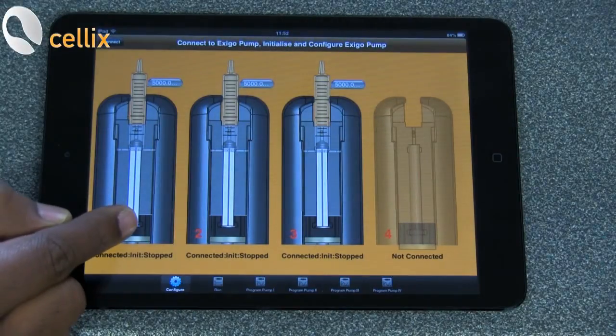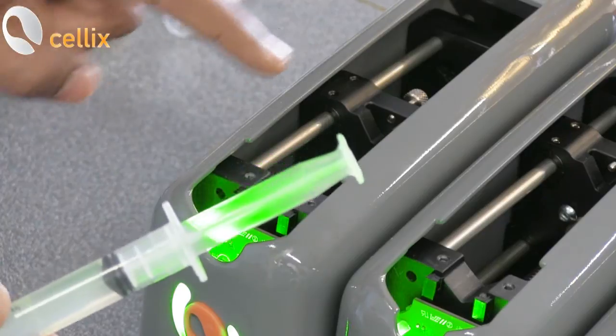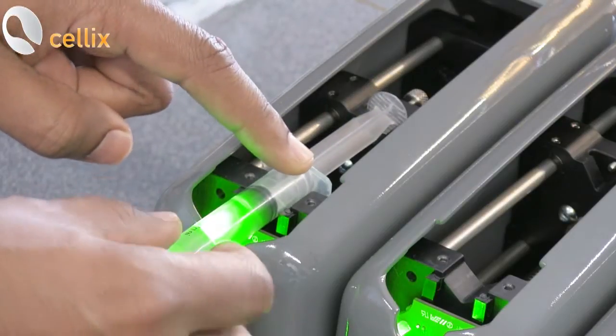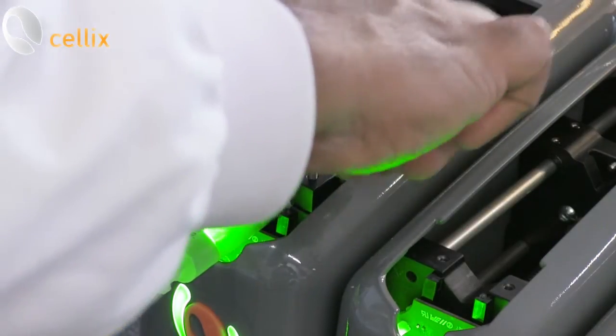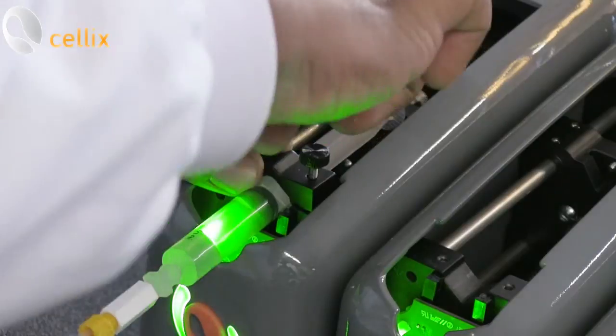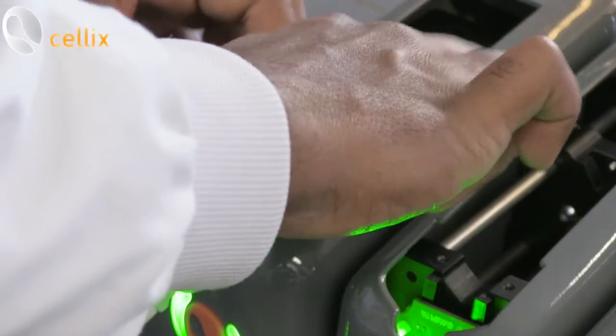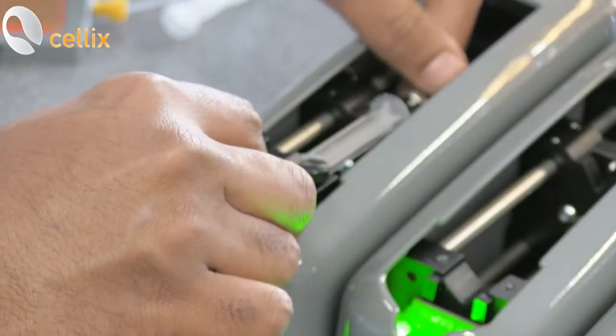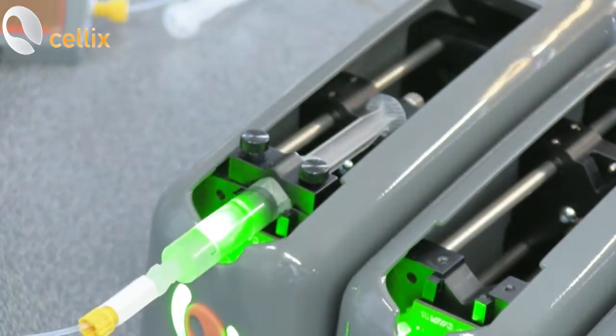Do the displacement of the syringe. For that you can move the plunger like this. This is the syringe. We have done the displacement using the app for positioning the syringe. So you put the syringe here. We have a clamp. So now your syringe is set.